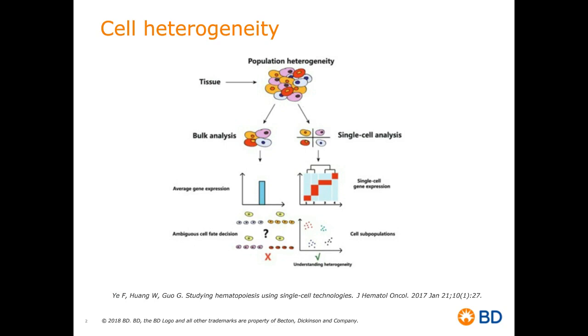And today, we will focus on two single-cell analyses, flow cytometry and single-cell RNA sequencing. How can they be used individually to address cell heterogeneity, but most importantly, how can the integration of both really take us to a further level of characterization of cell heterogeneity.